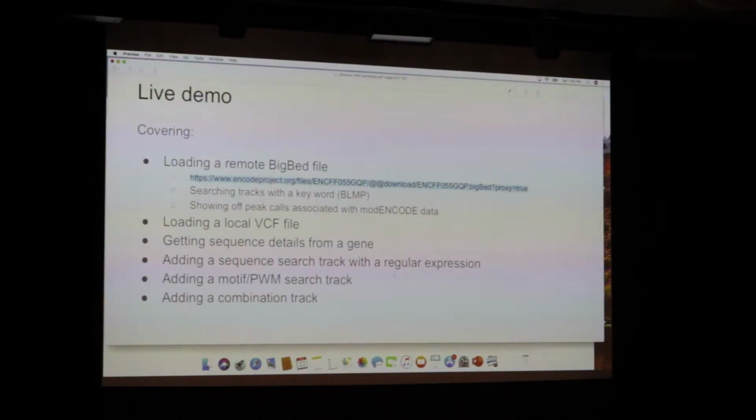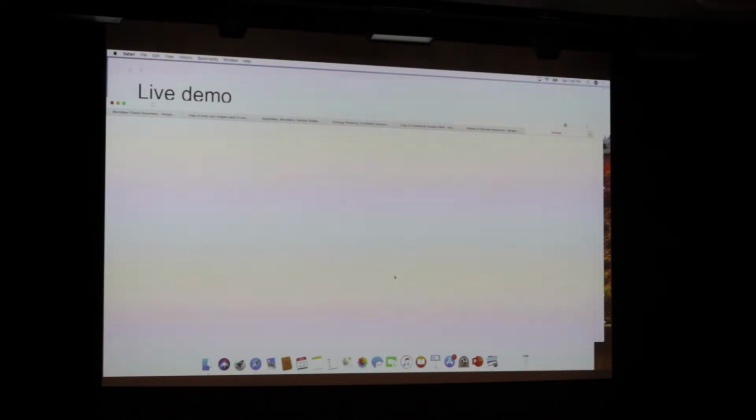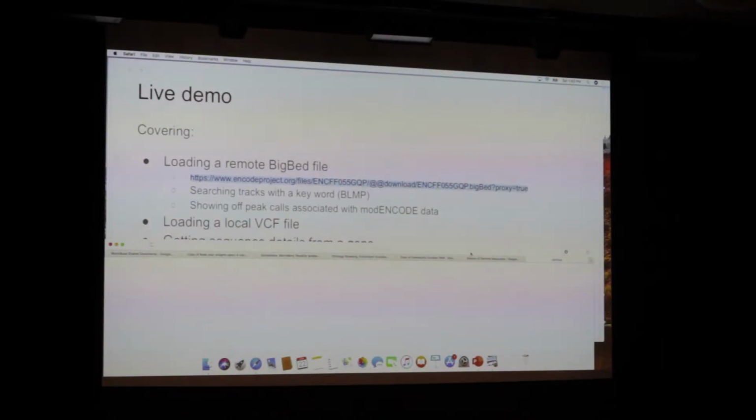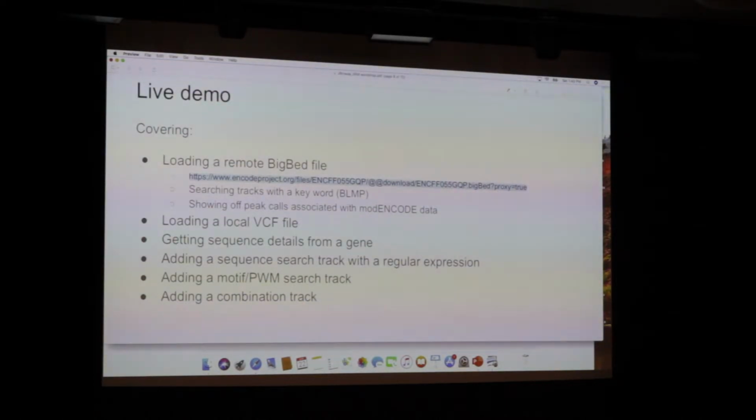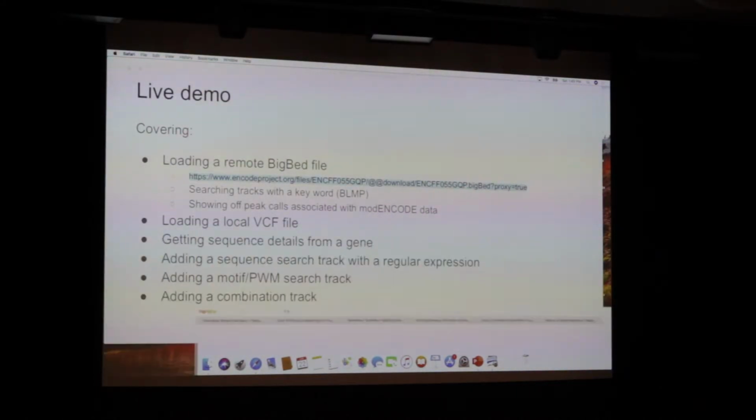Let me see what other things I want to do here. 3 minutes. What's that? 3 minutes. Oh, I got 3 minutes? Okay. I won't talk super fast. I'll just talk kind of fast. So. Okay. How does it keep getting lost? Tell me I didn't close it.